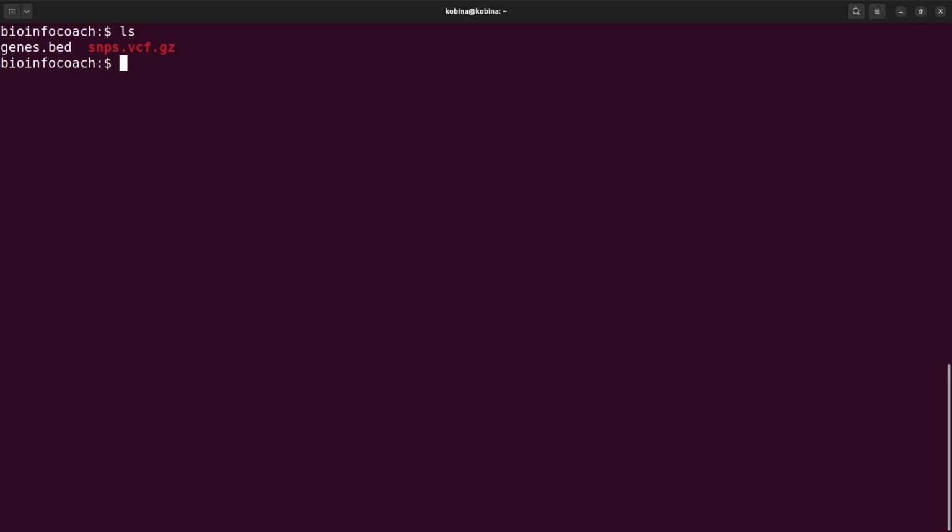All right, okay, good. Now let's start. First of all, we will need to do a bit of exploration. I like us to do this so that beginners can appreciate and understand what we are doing. Now this is the bed file, which has information that we will need. This information will now be added to the information we have in the VCF file.